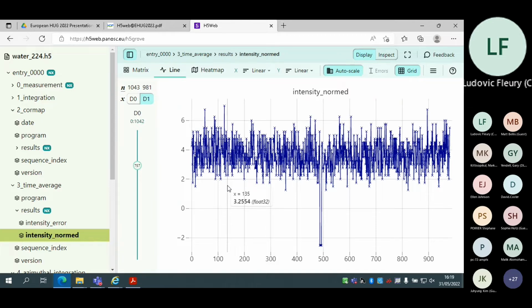And again, I want to stress that this is quite optimized in the sense that H5Web will only request the data for the slice that we are visualizing right now. So even if the dataset here was 10 millions, I will only fetch the 1,000 points I need to display this slice. Again, this is to make the visualization quite performant for big datasets.